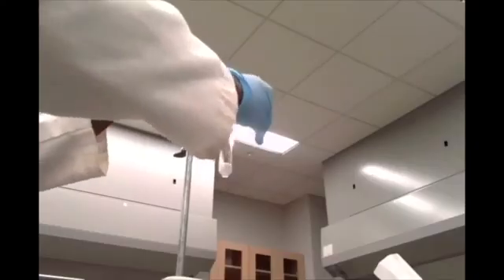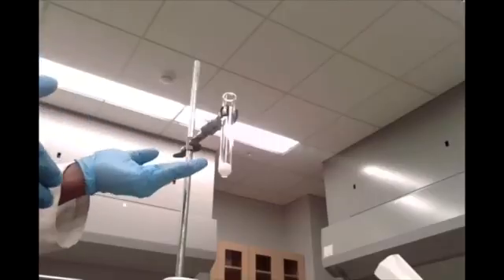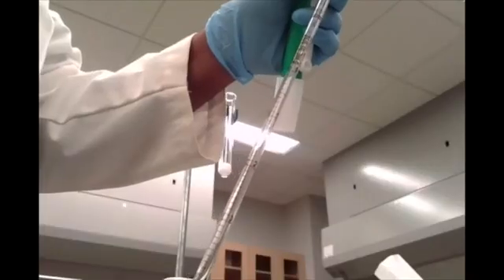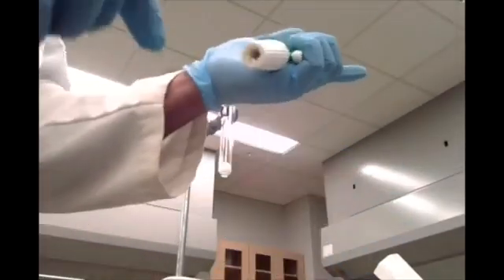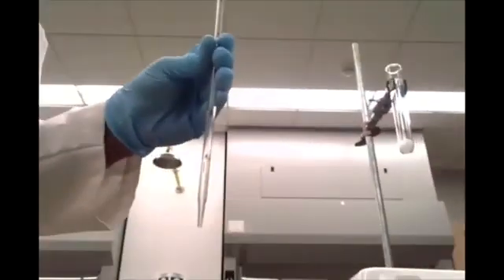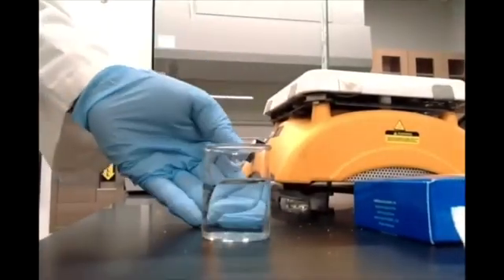All right. Let's keep that ready here. Now, to make sure that we have exactly 5 milliliters of water to add to this test tube, we're going to use a pipette. Our pipette here has markings on the side, and this pipette specifically is designed to measure out exactly 5 milliliters of water. So we're going to use a pipette bulb and attach it to our pipette here so you can see what I'm doing. Here I have a beaker of distilled water.